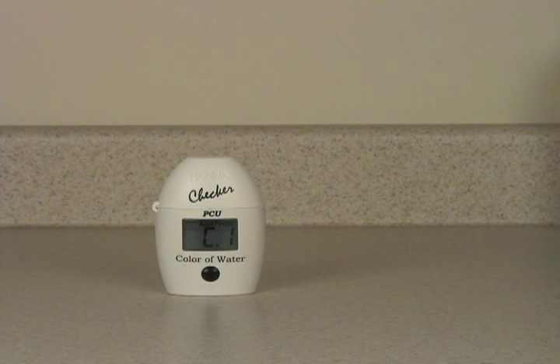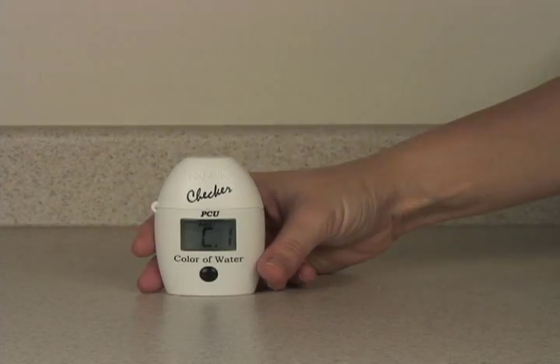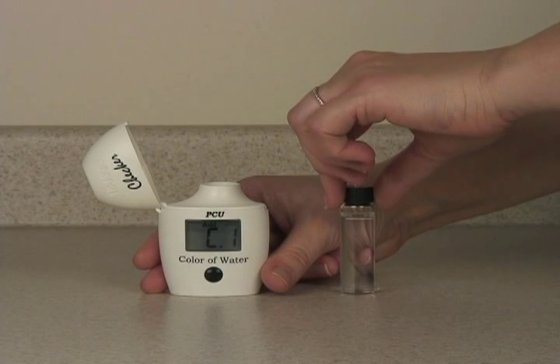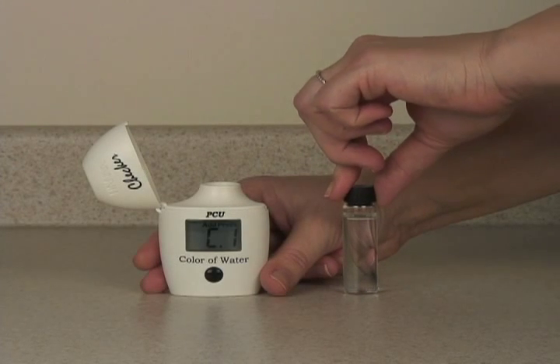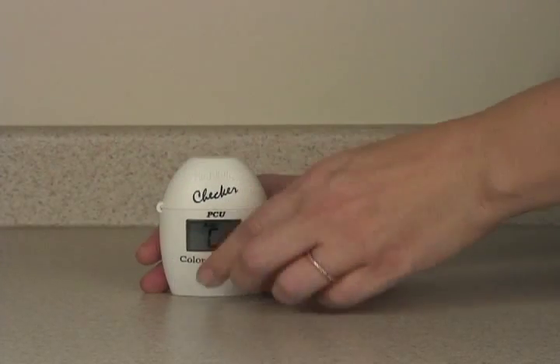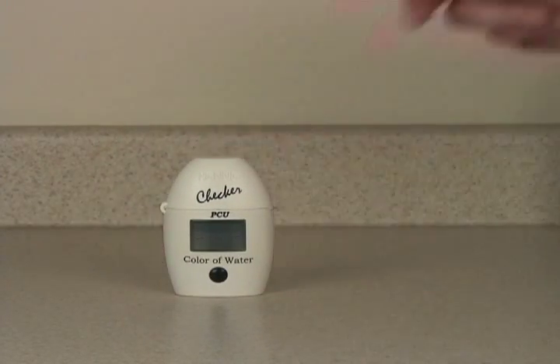Today we're going to test the color of water with the HI-727 color of water checker. The first thing you do is zero the instrument. You fill a vial with 10 milliliters of deionized water — this is your blank. Put the blank in the checker and press the button once to zero it.